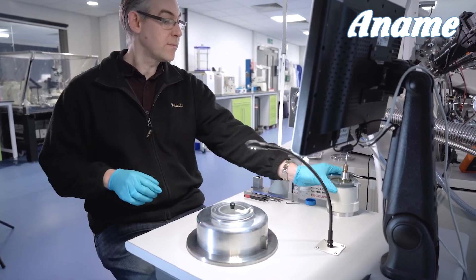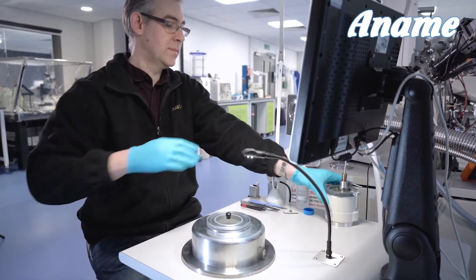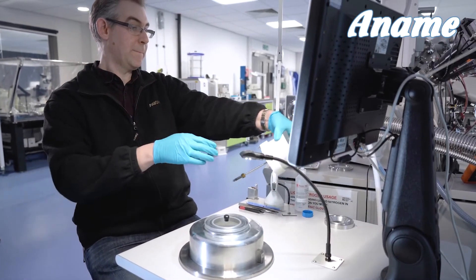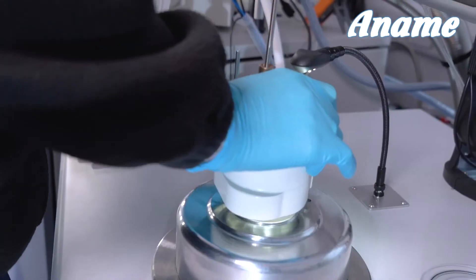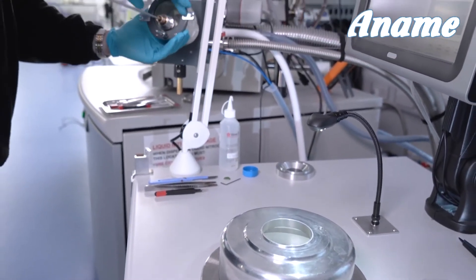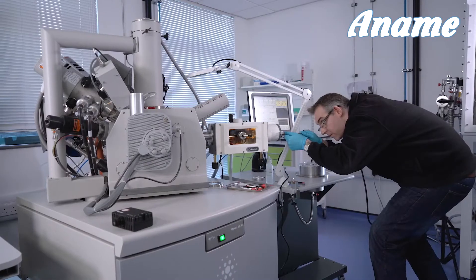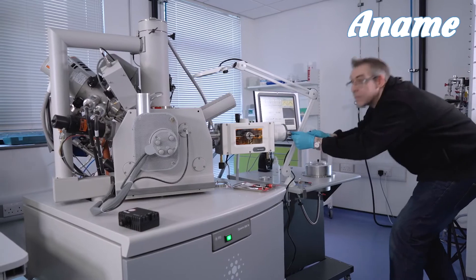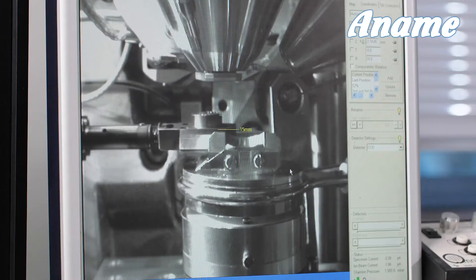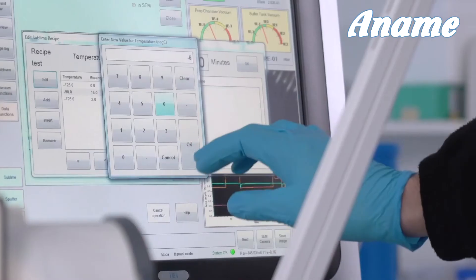The advantage of using an on-column system is the speed at which you can naturally prepare your samples and do all the preparation needed — coating, fracturing, sublimation, and so on. You do one airlock operation and your sample is into high vacuum immediately and never leaves that high vacuum. If you use an off-column system you're continually doing airlock operations transferring between different preparation areas, and there's always the risk of contamination.